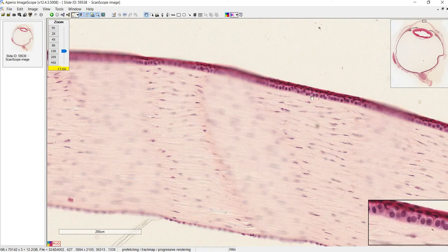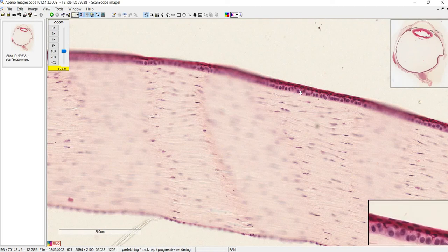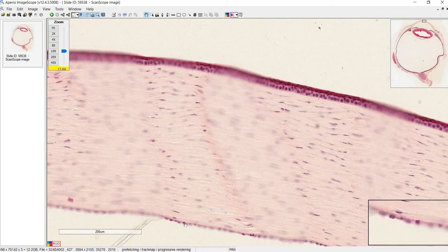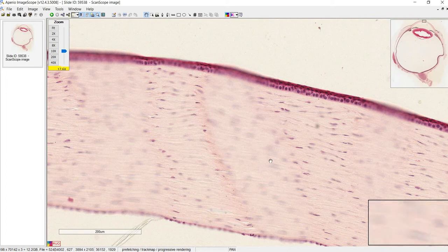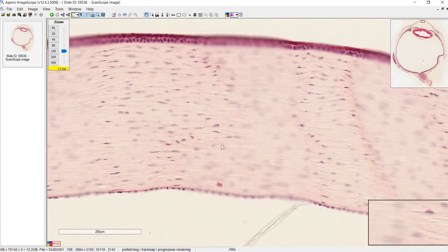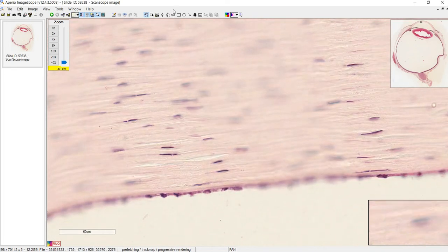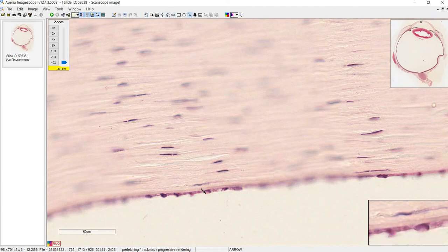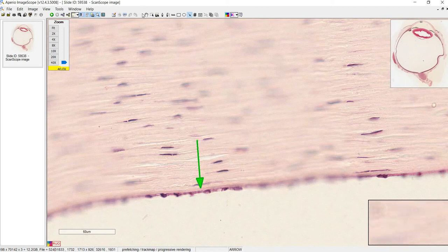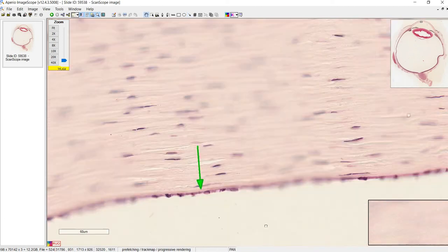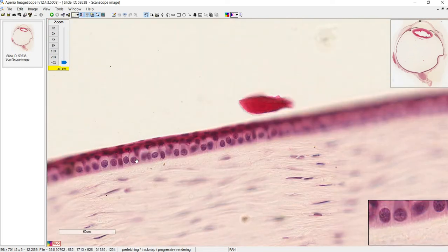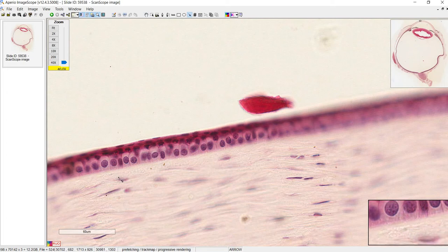The basement membranes also have special names. The corneal epithelium sits on Bowman's membrane, and the corneal endothelium sits on Descemet's membrane. In light microscopy slides it's really hard to see basement membranes — they're usually very tiny structures and you need electron microscopy to see the details. But just underneath the epithelium there's a light-staining area that could be the basement membrane, and up here there's another faint light-staining piece that would probably be Bowman's membrane.